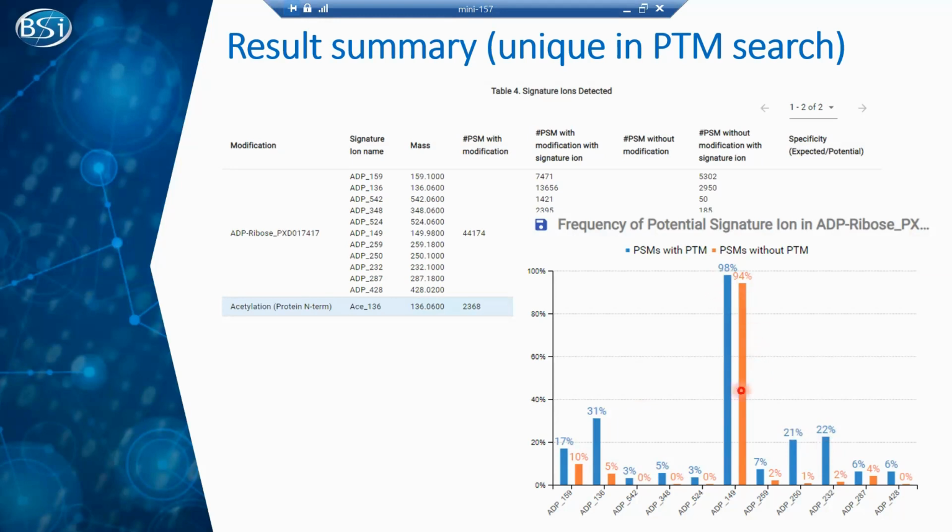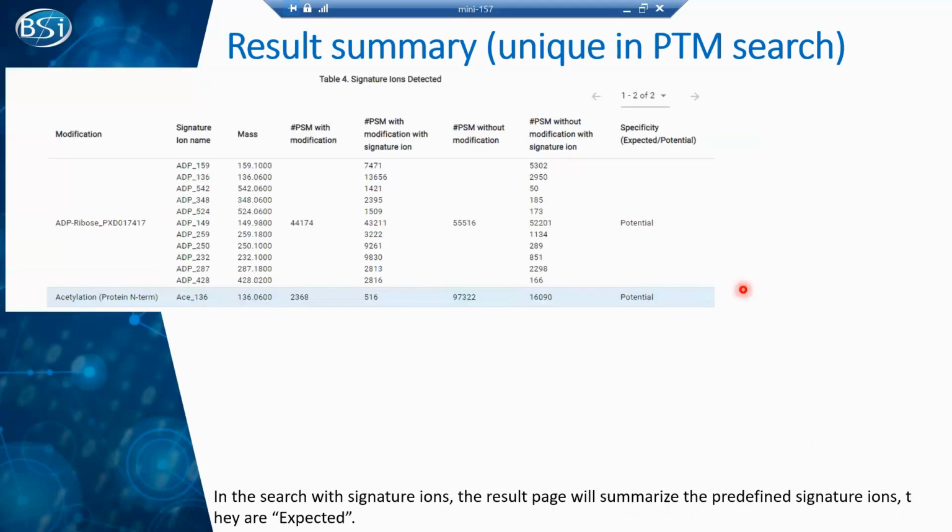In here, since it is for demo use, I adjusted some parameters, so the difference is small. You can see here the difference between these two is just 4%. So it's just for the demo use.